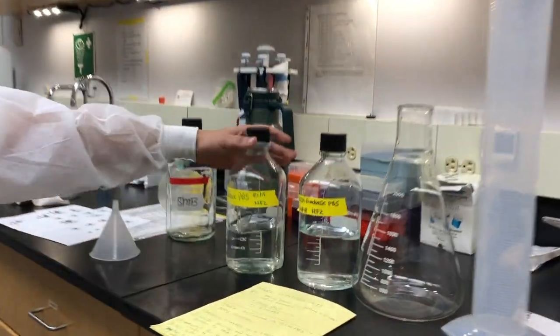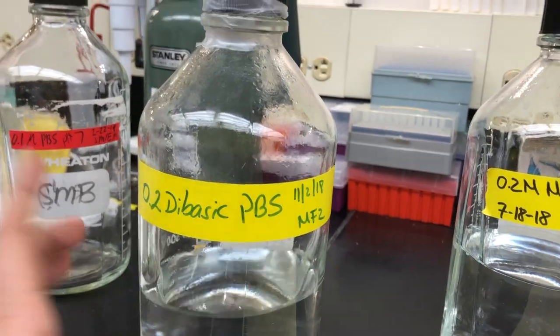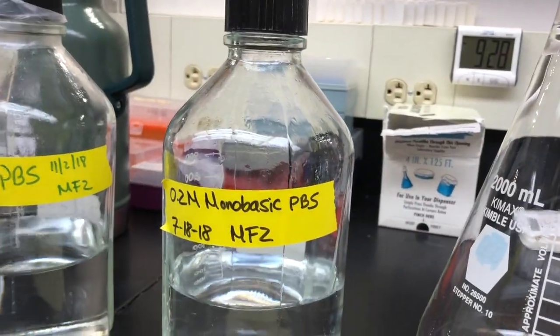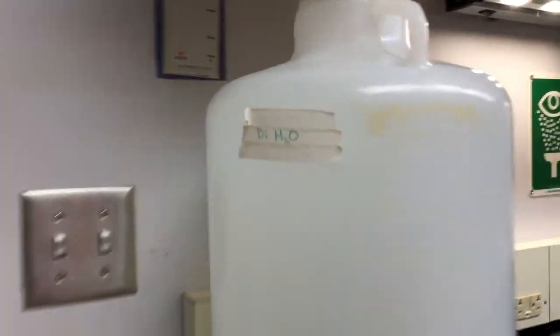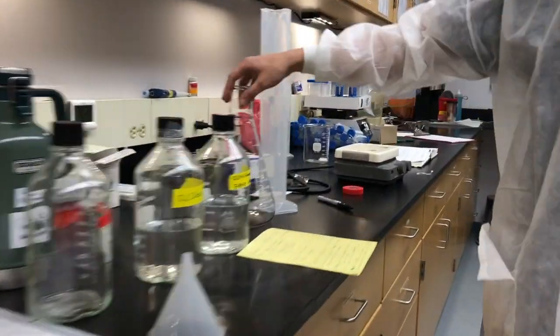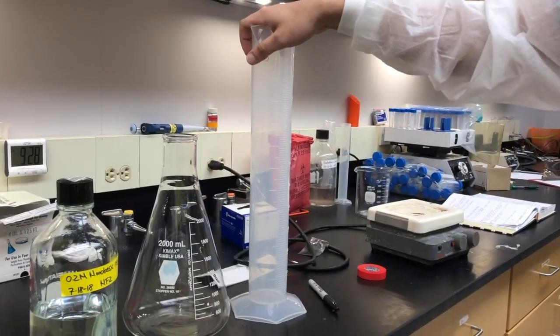Here are some of the things we're going to be needing. We're going to need 0.2 molar of dibasic PBS, 0.2 molar of monobasic PBS, and also deionized water, or DI H2O. A couple other materials you'll need: a beaker or flask that's at least one liter, and also a graduated cylinder for measuring.